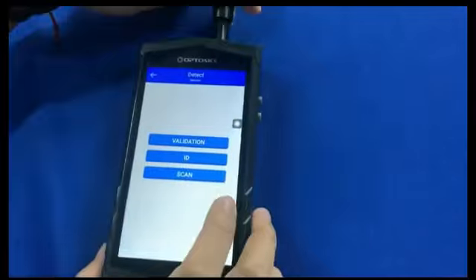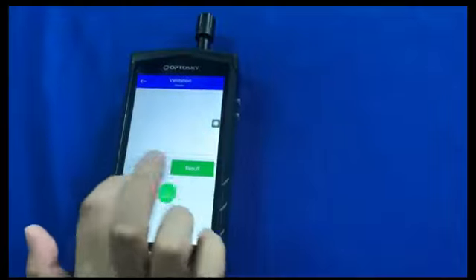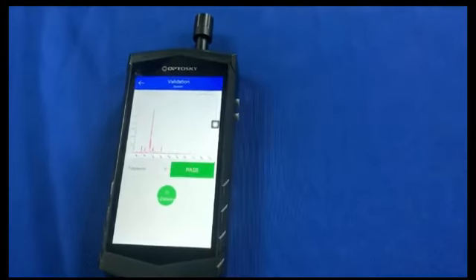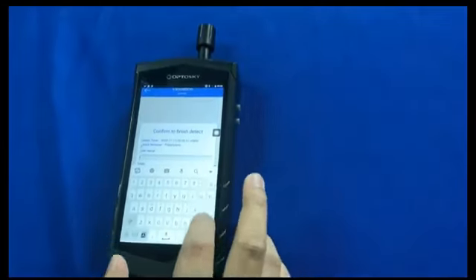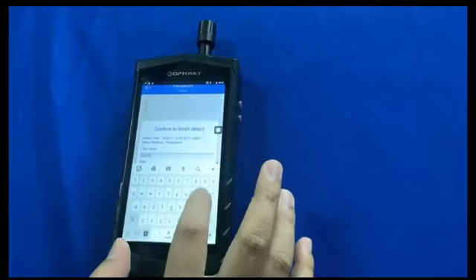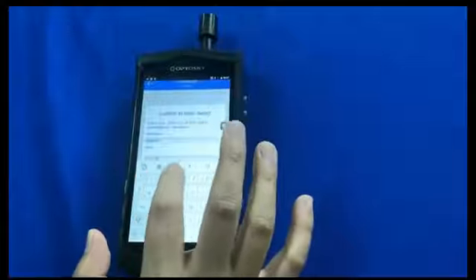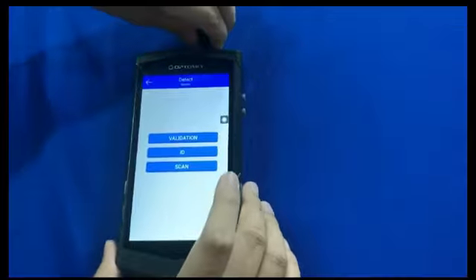And then we move to test 7, setup method and identification and electronic signature test. First of all, we log in as the supervisor and create a new method name, paracetamol test, followed by scanning the barcode of the supervisor with the account.